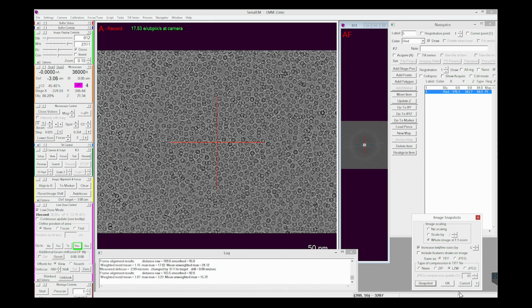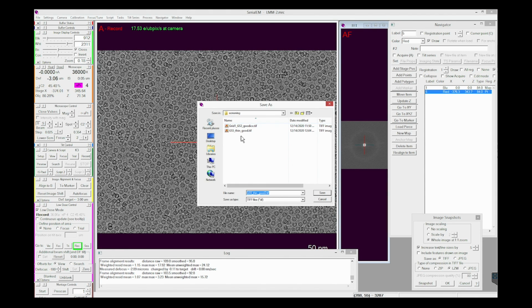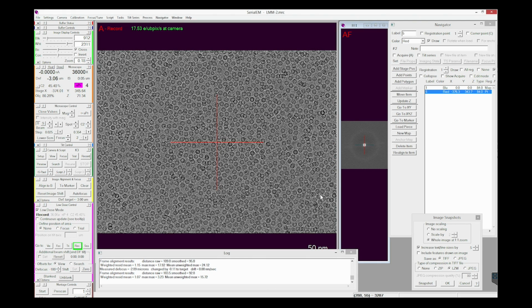Another great image. We'll do a snapshot. We'll copy that name and we'll say thin 2 and save.